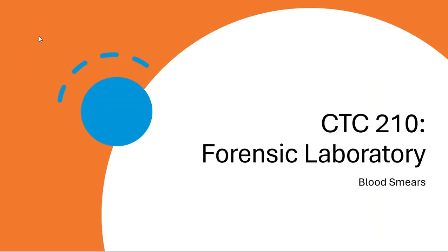All right, so if you need help, when you come into the lab and you use our microscopes, you'll find me, you'll find someone there that can help you. So just let us know, give us a heads up of when you're coming and what time that you'll be there, and then we'll make a date. And our date hopefully will go very smoothly, and you'll be in and out in a matter of no time, and that way you can take your images and make a presentation.